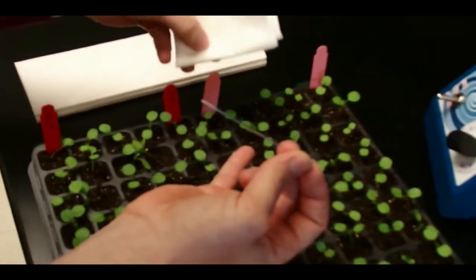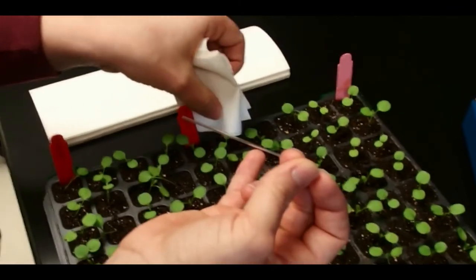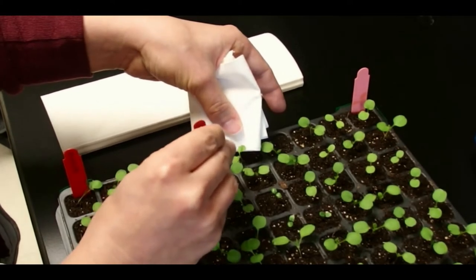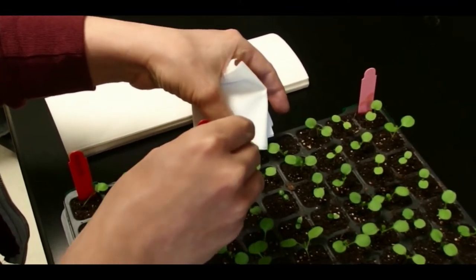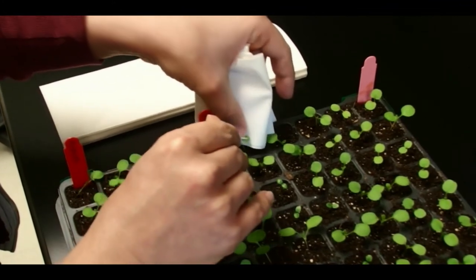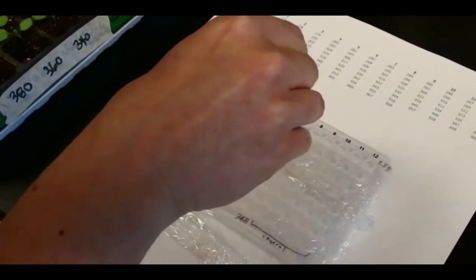Yeah, this is hard, so we have to keep the order. Sarah's doing a great job of checking to make sure we have the order correct. It's not so hard because you will notice a little hole in your plant, so you'll kind of know which one you did last, and you'll have a capillary tube hanging out in the PCR well that you just put it in. So with this system, we won't mix up stuff very easily.